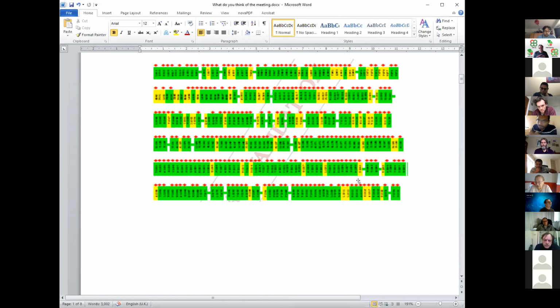But I don't know how to feel about that. I did so previously, and actually never checked the EMDB data validation fast. But after this paper, when there was quite a lot of wrong fitting and non-existing densities, I checked the PDB validation of the data, and I looked at this map. It's another paper, and I was really shocked. I cannot understand what is wrong, but this is one of the practical issues which have to be fixed.